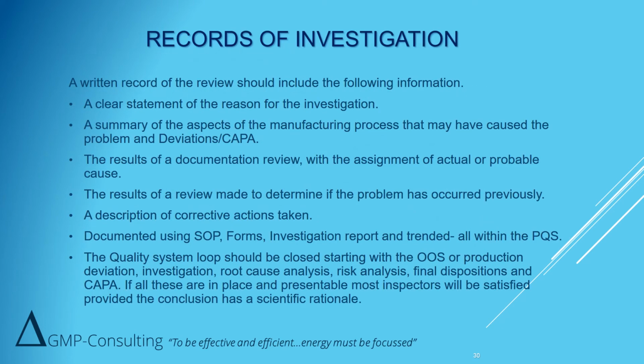At the end of the day, when the investigation has been completed, you're expected to have full and complete, accurate records, passing data integrity regulations, for the whole OOS process, and this will follow through hopefully to deviations and CAPAs, etc. Make sure the whole quality system loop is closed, and you have your investigations, your root cause analysis, risk analysis, and the final disposition.